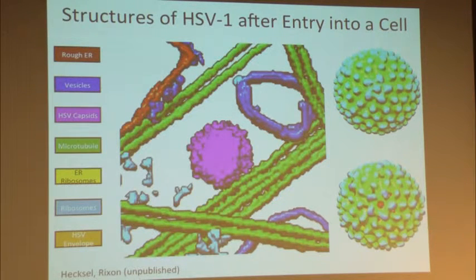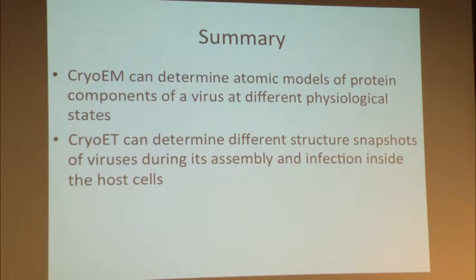on the herpes. And finally, I'd like to summarize what I told you today, that the cryo-EM can determine atomic resolution of protein components of virus at different physiological states, before DNA comes in, after DNA comes in. Secondly, I also showed you some of our latest work in tomography, which gives you a different structural snapshot of the assembly process of infections inside the whole cell.